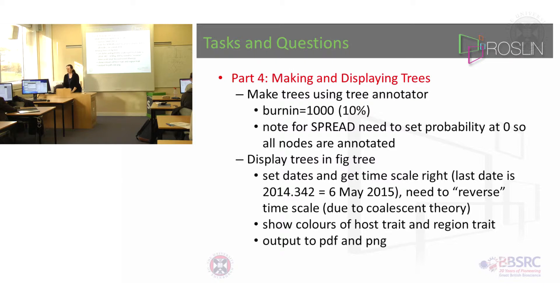So you should make a tree using Tree Annotator, and then you should display your tree in FigTree. As you've been noticing already, it's quite easy to open the trees in FigTree, but there are actually other settings in FigTree to put the timescale on it.